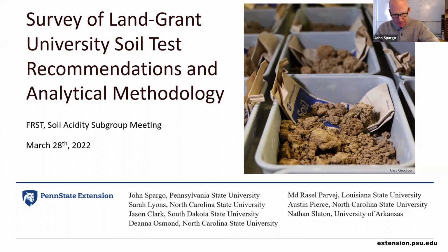So I'm going to try and keep this relatively brief, to leave time for additional discussion and to keep us within the hour. Bob asked about a month ago if we could share some results specifically about pH and buffer pH methods that we collected from this survey of land-grant universities.